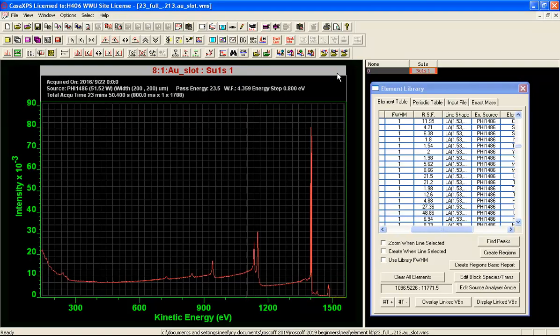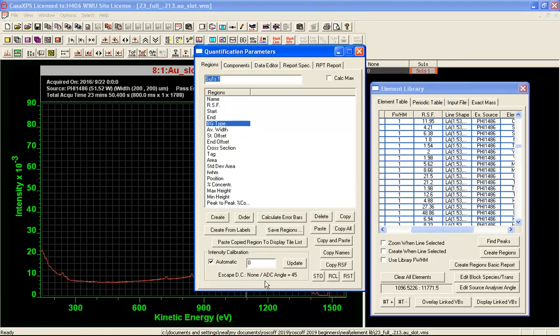At this point, we have data that recognize the fact that they have an angular distribution correction that needs to be performed for an angle of 45 degrees. There's a transmission function that is active and that was brought in from the SPE file. The escape depth correction currently is set to none. This is because if these were PHI sensitivity factors, the escape depth would already be included in the sensitivity factors that are supplied by PHI.